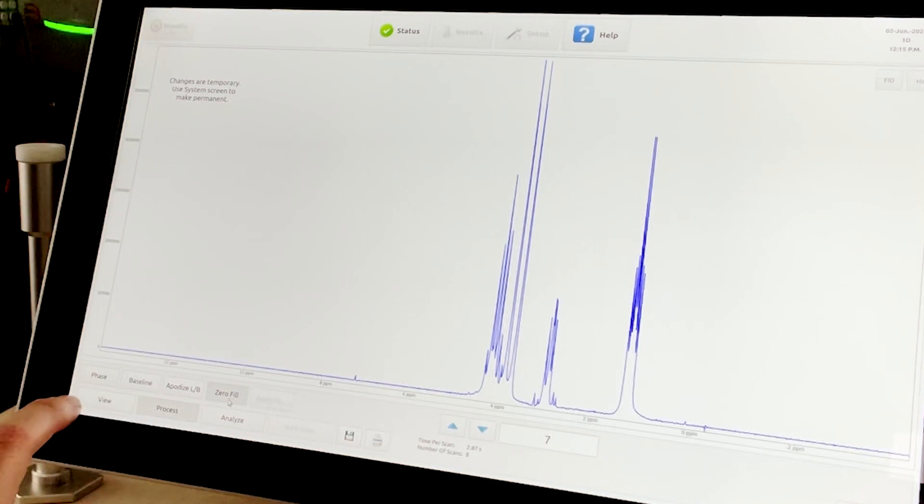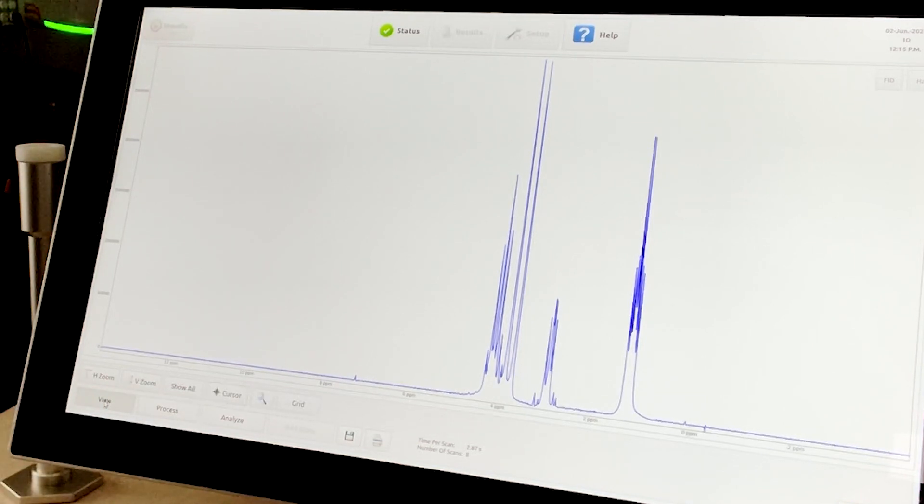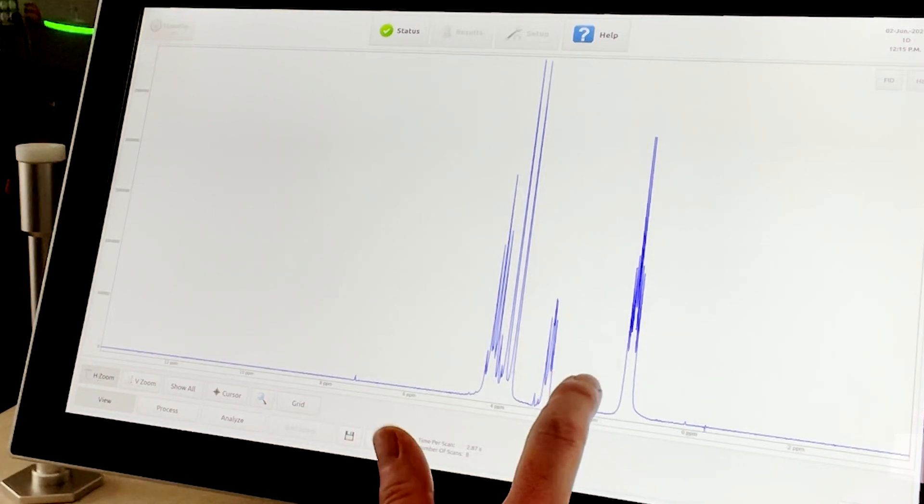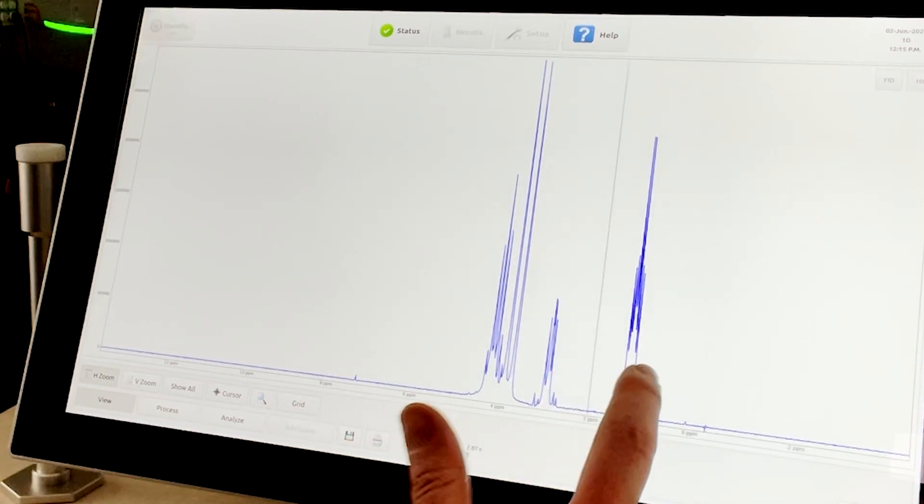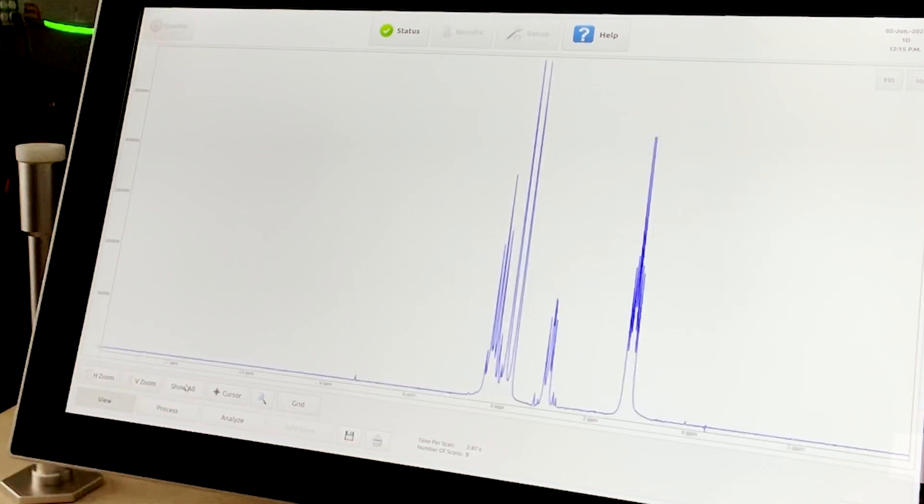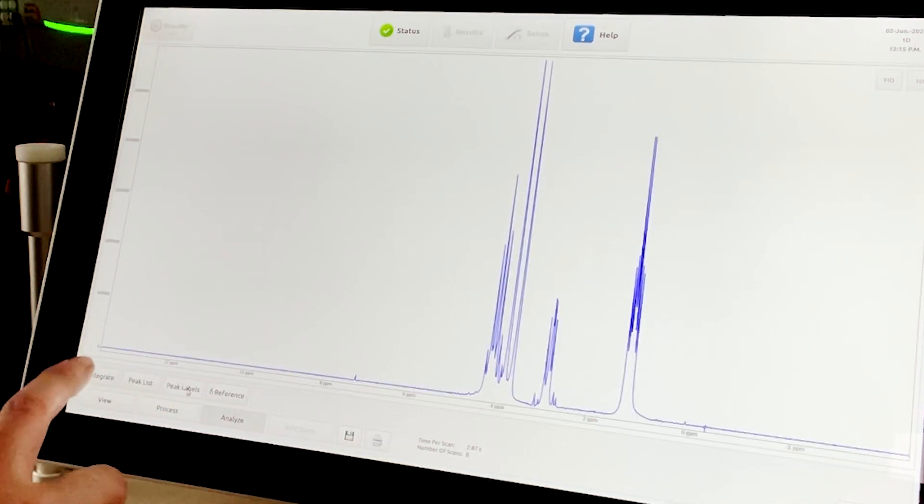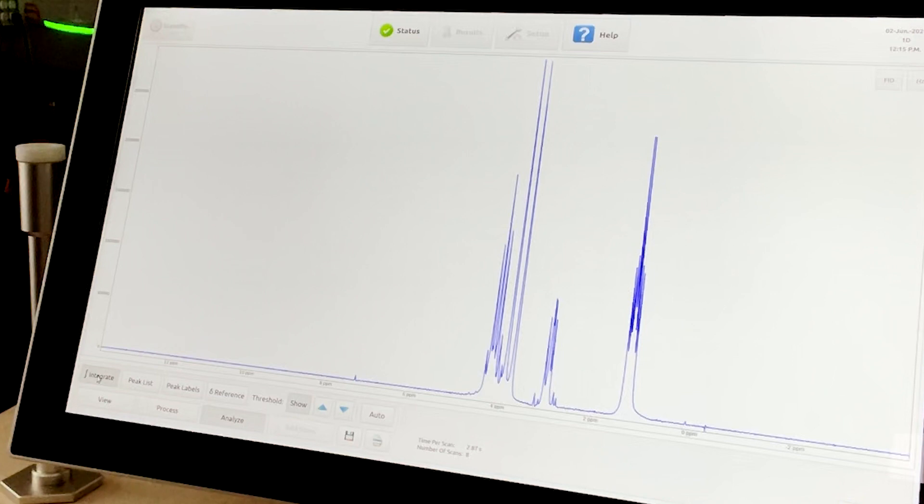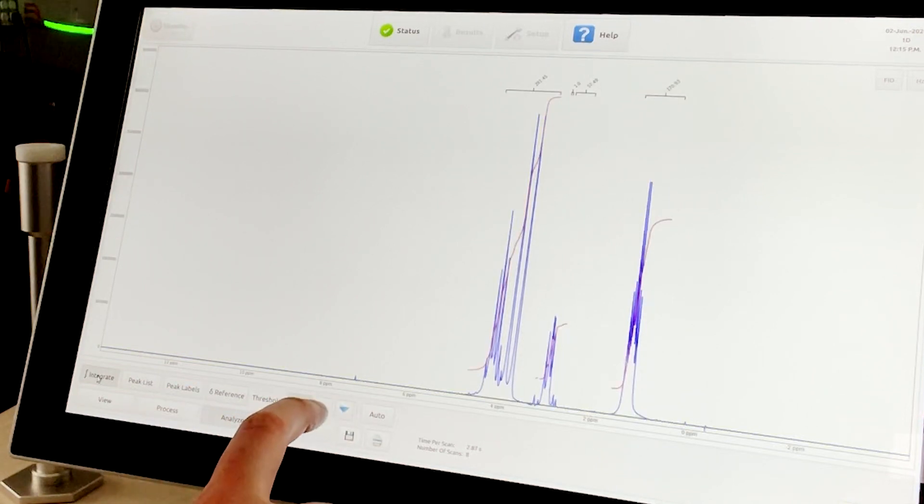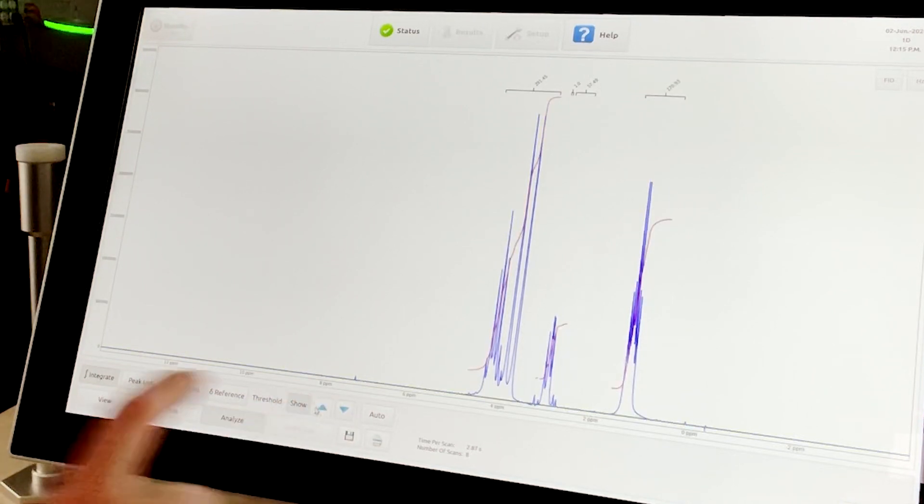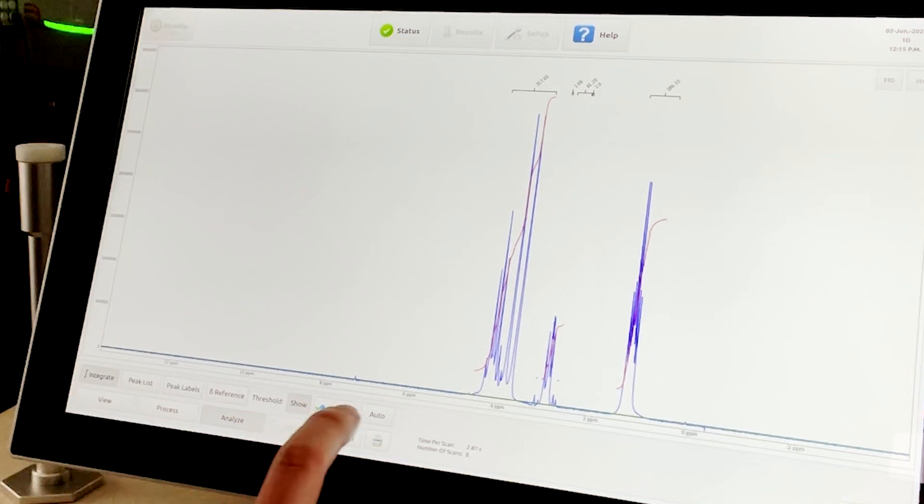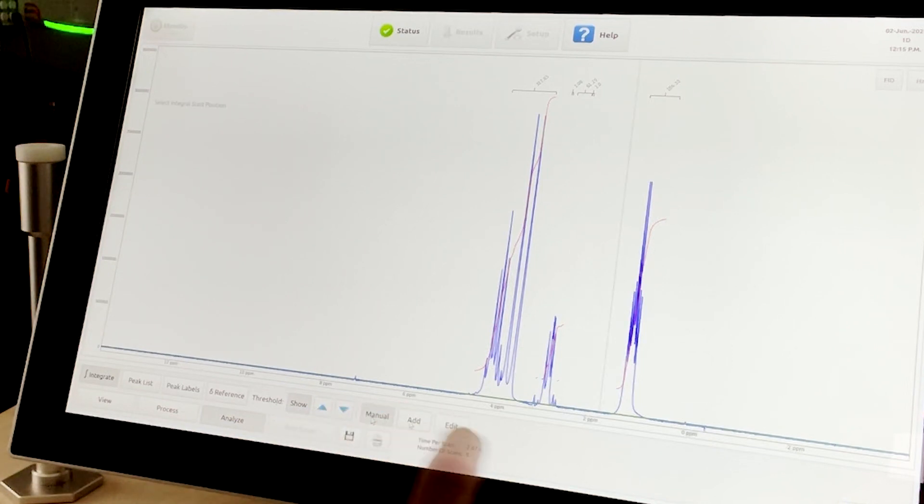To see a region a little bit better, the user can select View, Horizontal Zoom, and select the bounds of the region of interest. To better analyze the data, the regions of interest can also be integrated with manual or automatic functions, and the peak picks or labels can be applied.